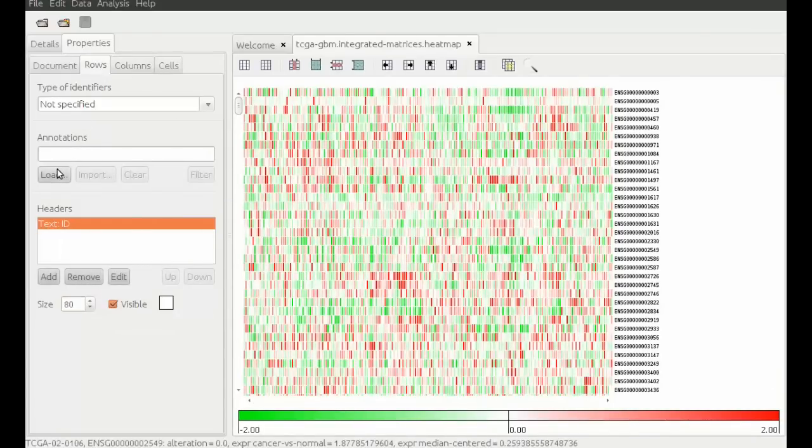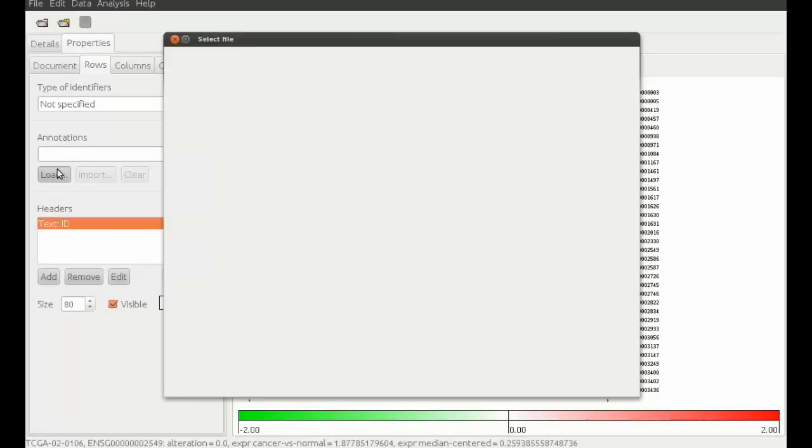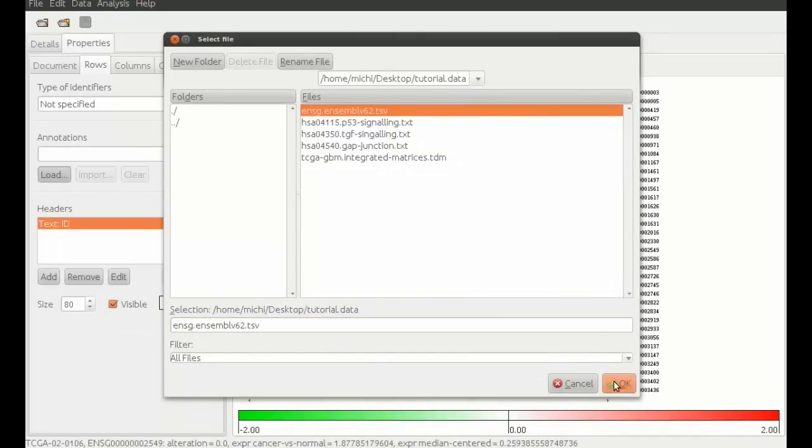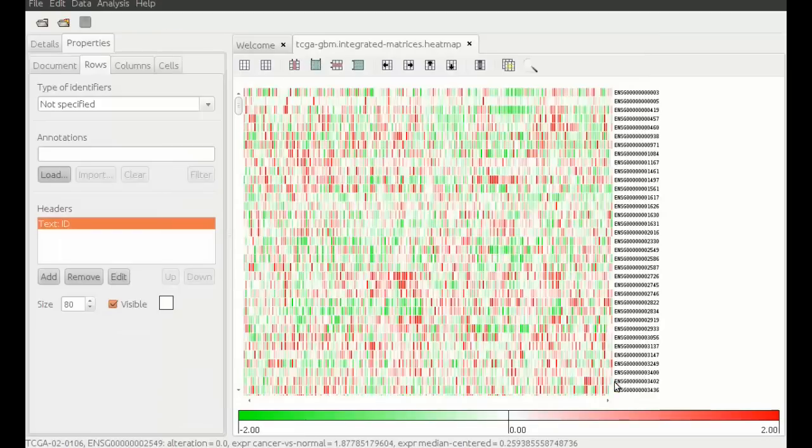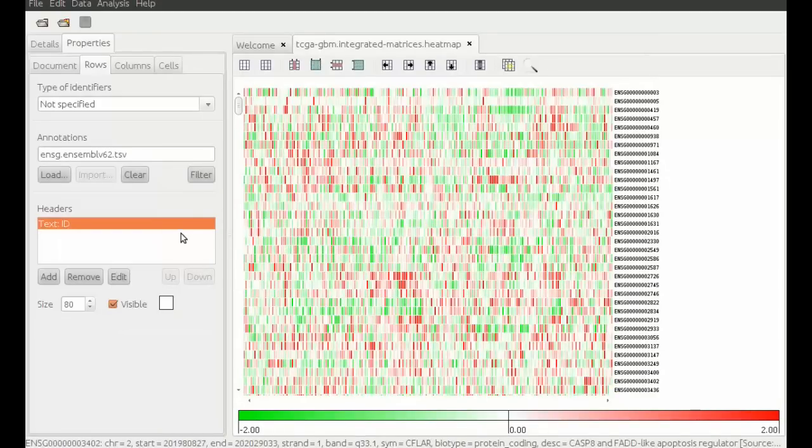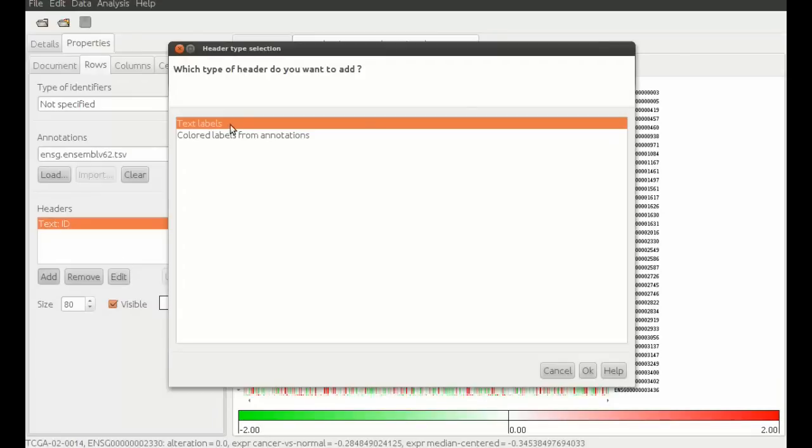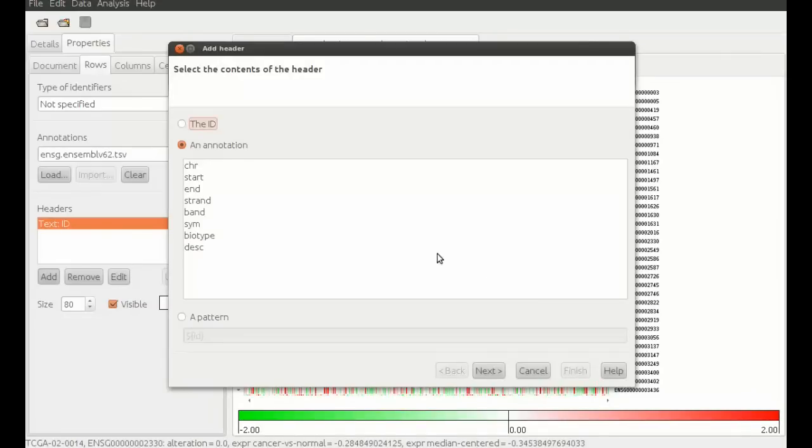Now we can load some annotations to understand better which genes we are seeing. We select the prepared file and add the new header. We select a text label because we want to annotate the matrix with the gene symbol.